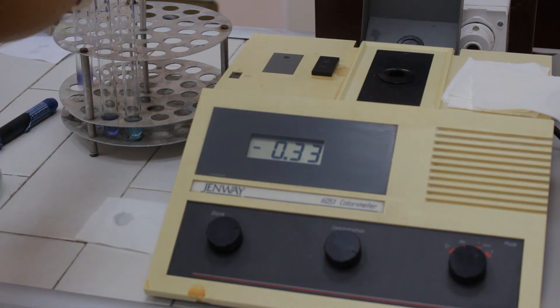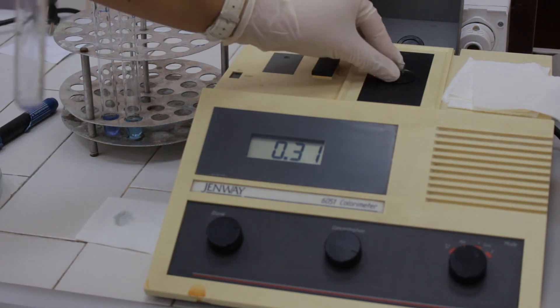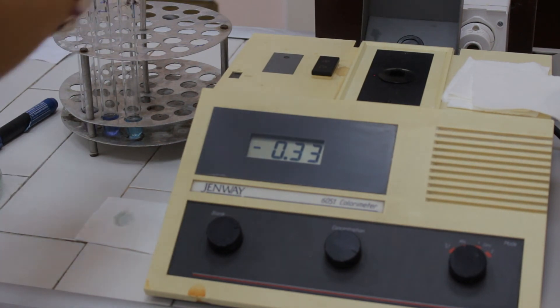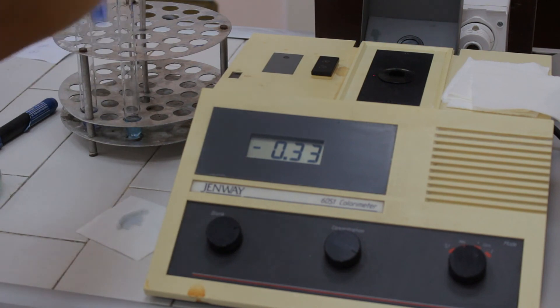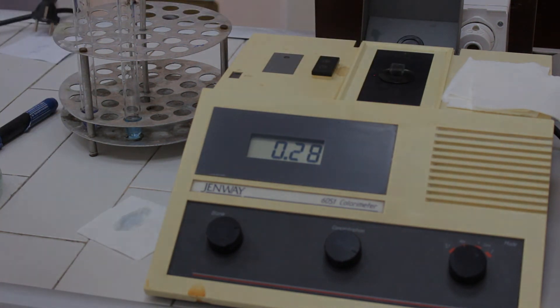Then read the absorbance of the test solution, the unknown solution, which is blue-pink colored. Repeat the same procedure with the standard solution, also blue-pink colored.